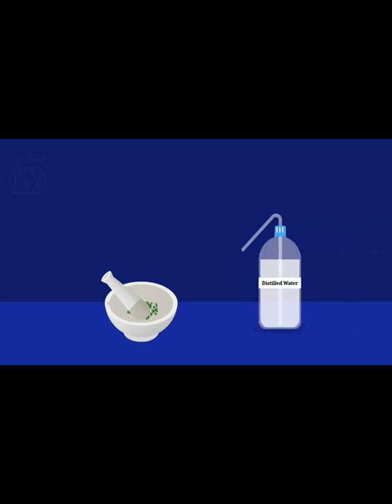Extraction of pigments. Weigh 5 grams of leaf sample. Cut the leaf into small pieces. Grind them thoroughly in a mortar and pestle. Mix with distilled water and grind them thoroughly into a fine paste.